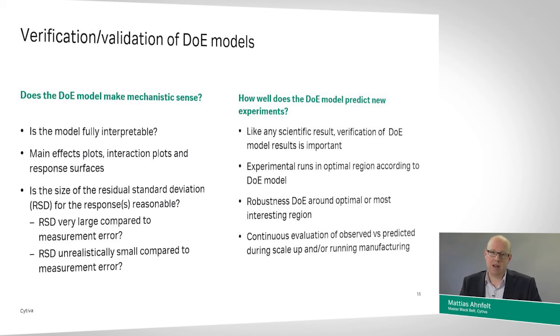Then once the model is developed and seems to be working fine, a very important follow-up is, of course, how well does our optimized and refined DOE model predict new experiments? This can be verifying runs in the same lab scale, same equipment and everything. That could be a starting point.